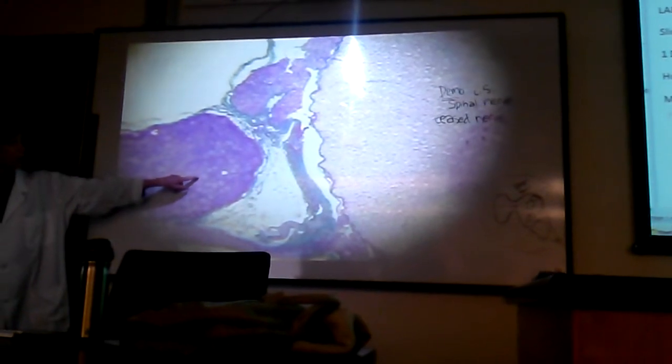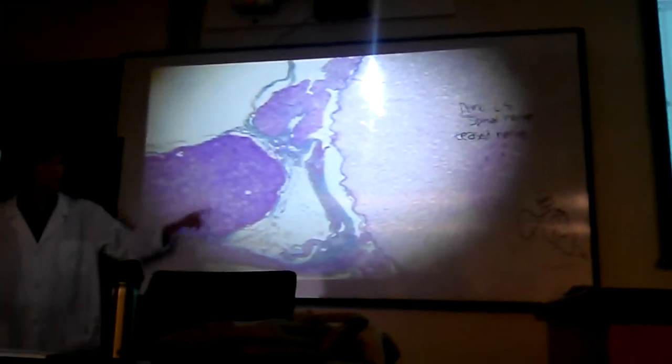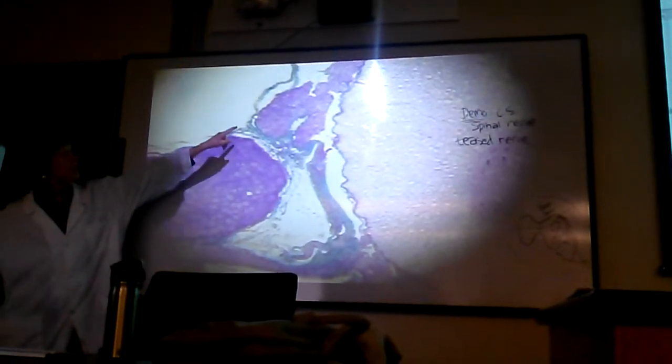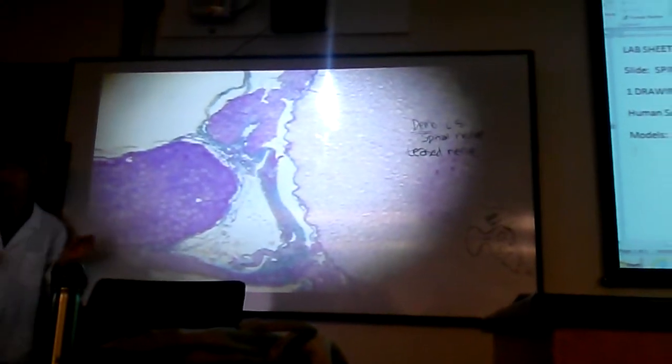Look at the big sensory neurons in there. You can get them. The big pseudo-unipolar neurons surrounded by satellite cells in the dorsal root ganglion. And again, way down here, these are cross-sections through the myelinated axons that have left this, and they're headed for the dorsal root and for the posterior horn.